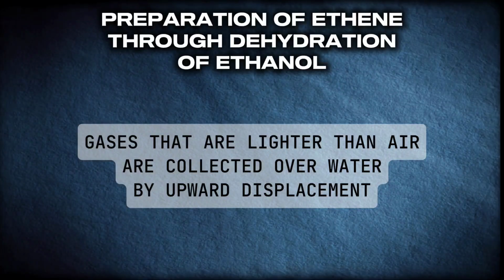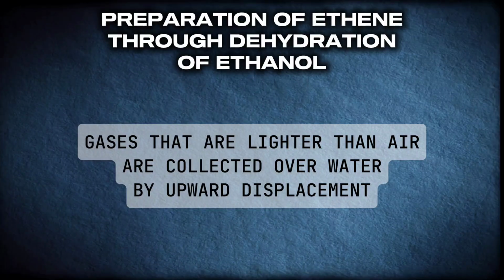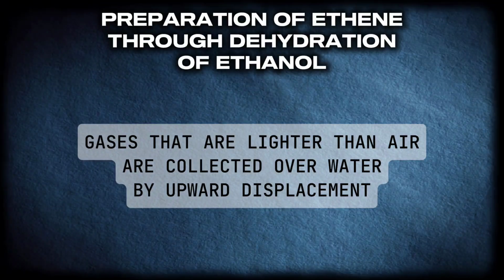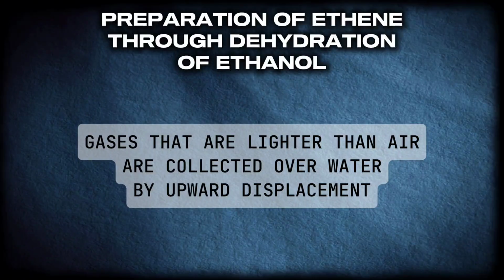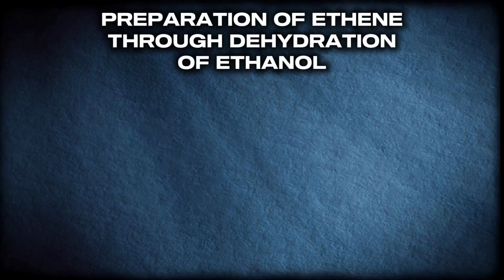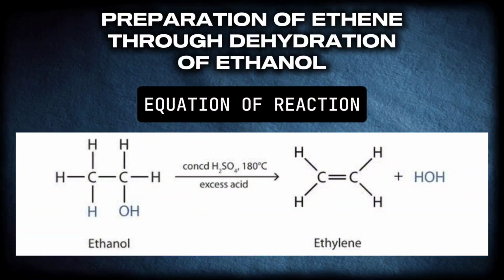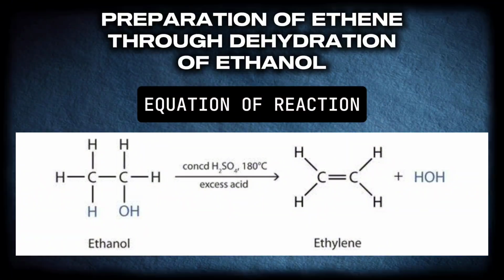All right. Now, the concentrated sulfuric acid serves as catalyst for the dehydration reaction. We will not be going into the reaction mechanism, okay? But this is typically the reaction, equation of reaction, as you can see here.